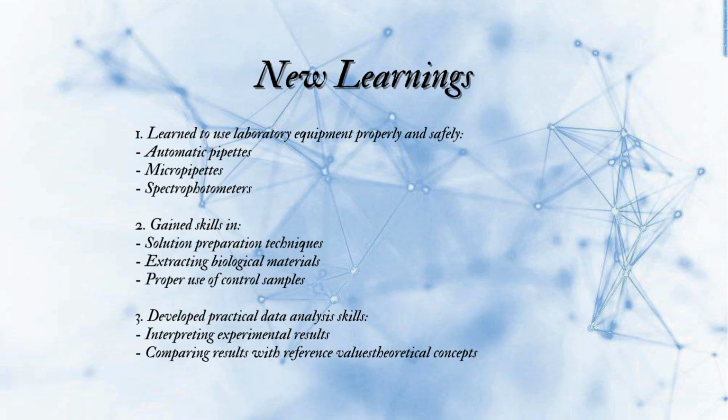There are some new learnings that I gained from the laboratory session. First is to learn how to use the laboratory equipment properly and safely, such as the automatic pipettes, micropipettes, and spectrophotometers. Next is to gain skills in solution preparation techniques, extracting biological materials, and proper use of control samples. Third is to develop practical data analysis skills on interpreting experimental results and comparing results with reference values and theoretical concepts.